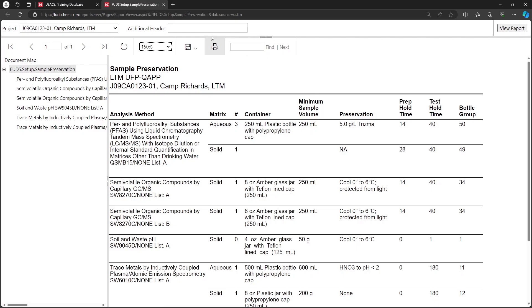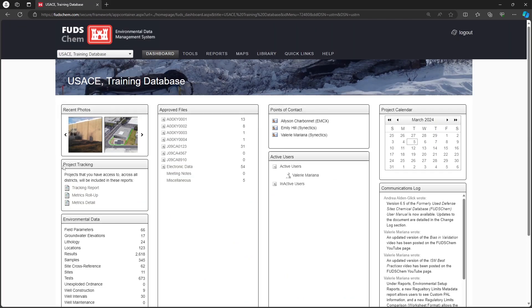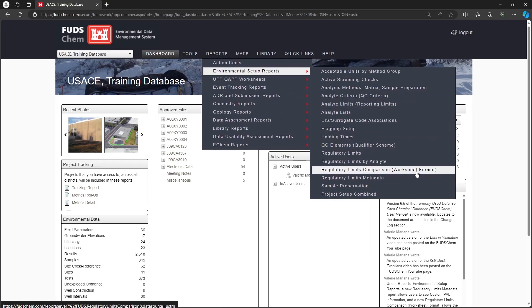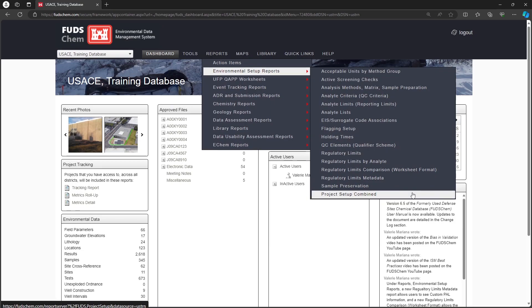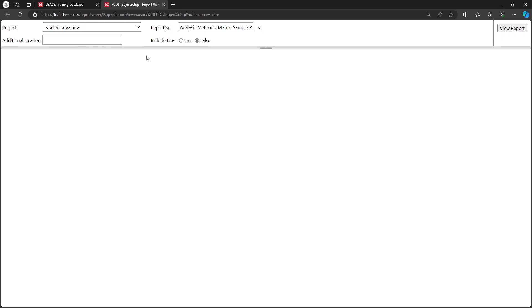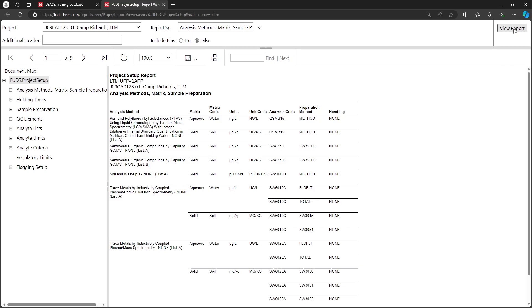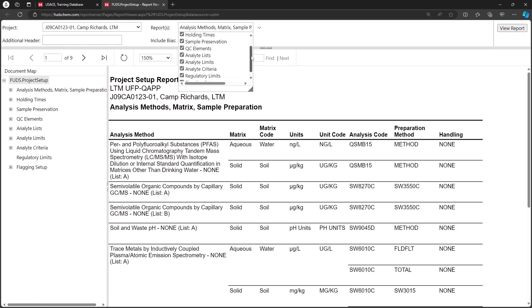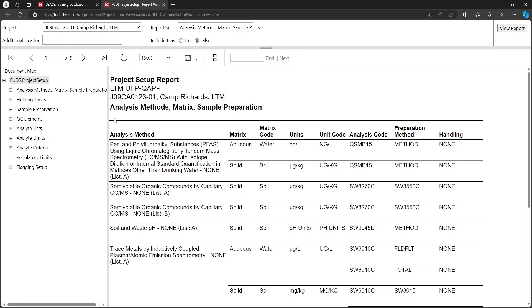Go to Reports, Environmental Setup Reports. Choose Project Setup Combined, choose the project, then click View Report. This report combines several of the above reports into a single report. Once you choose the project, the Reports drop-down allows you to decide which reports to include. Each of the selected reports appears as a separate section on its own page.